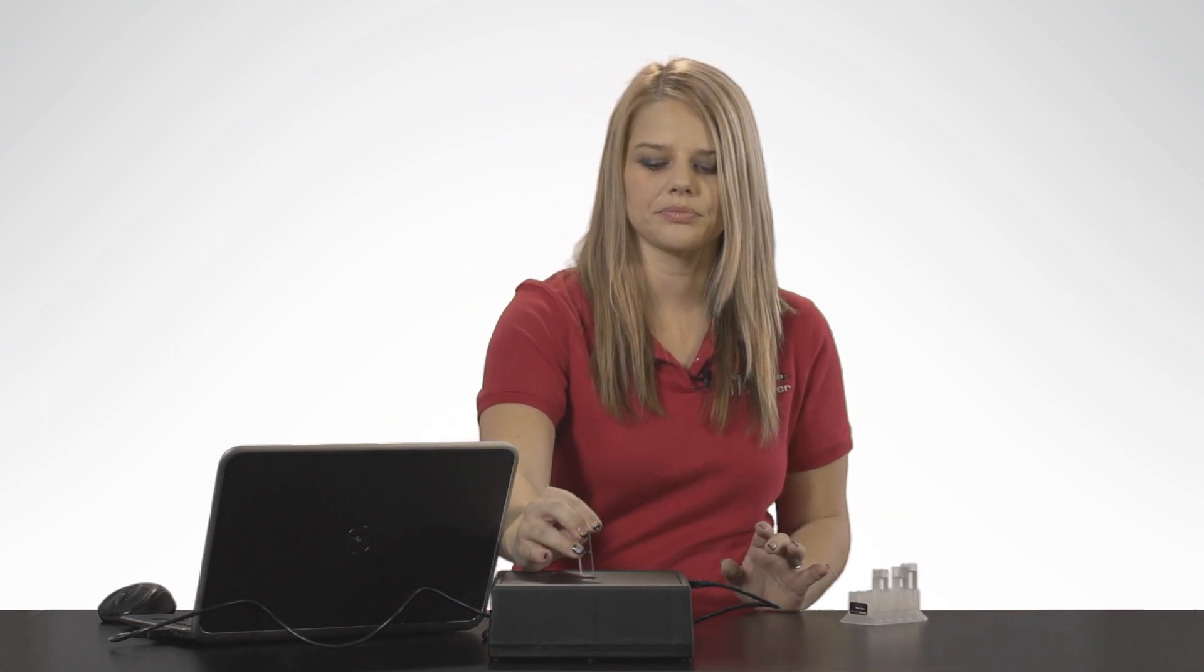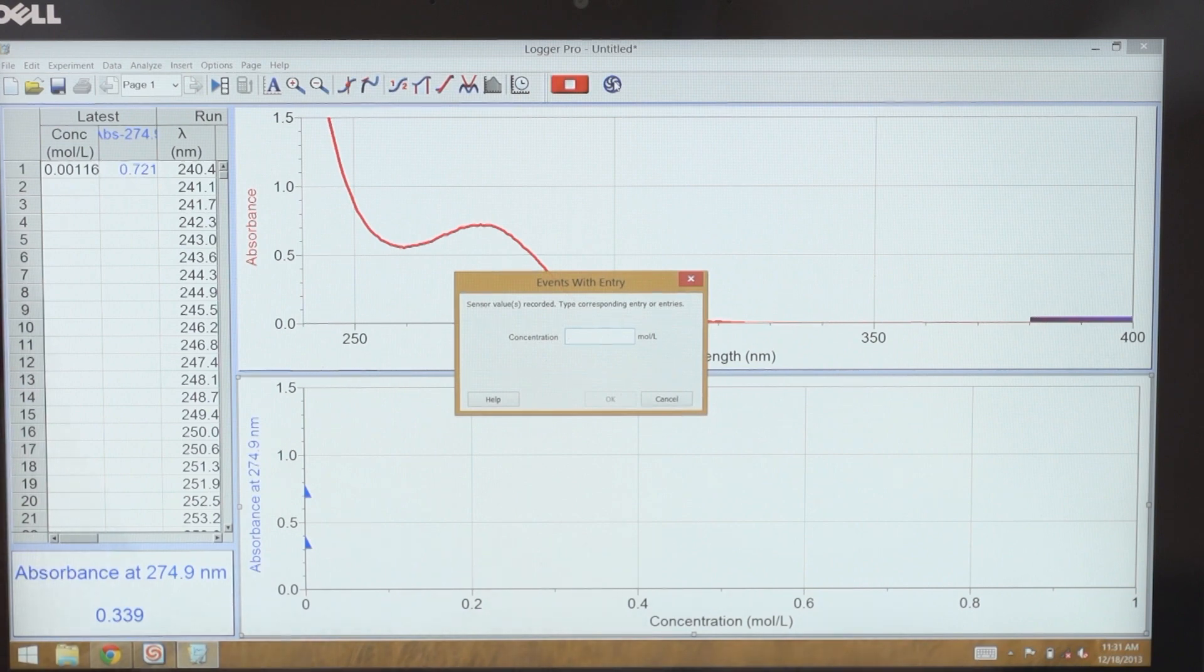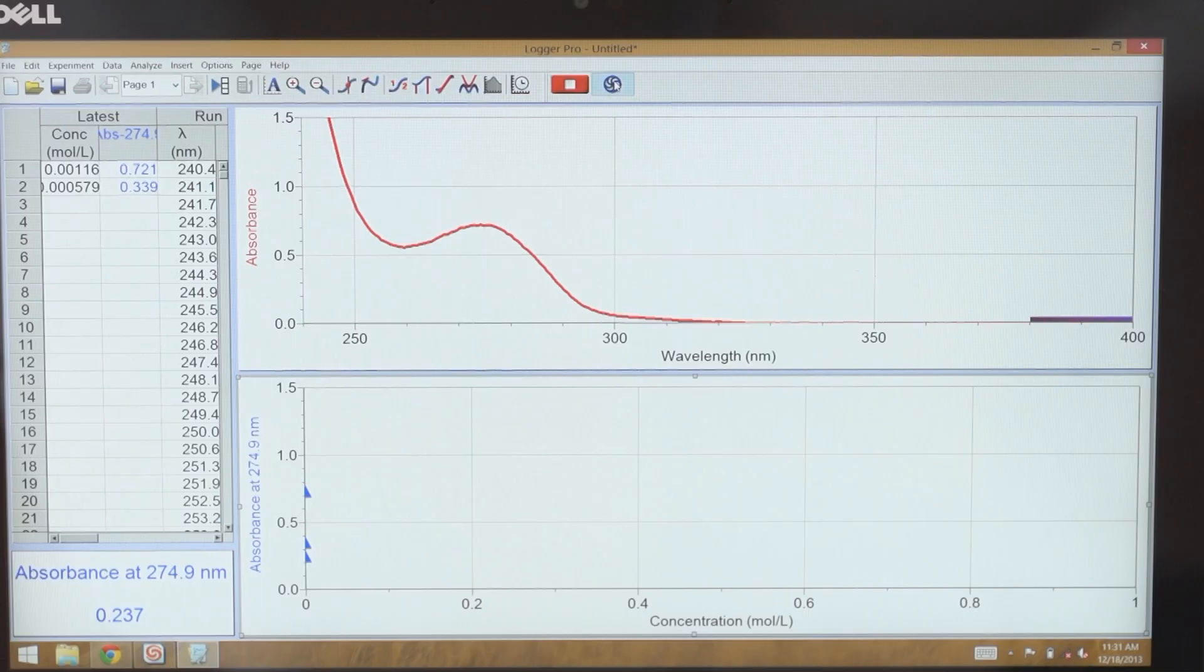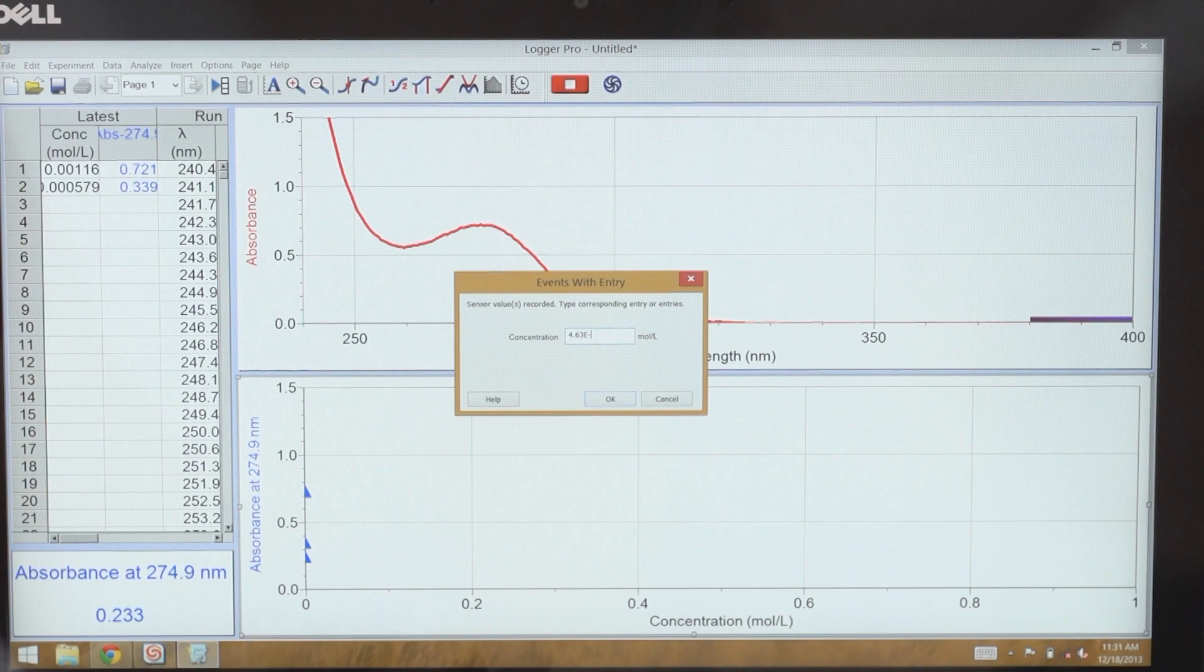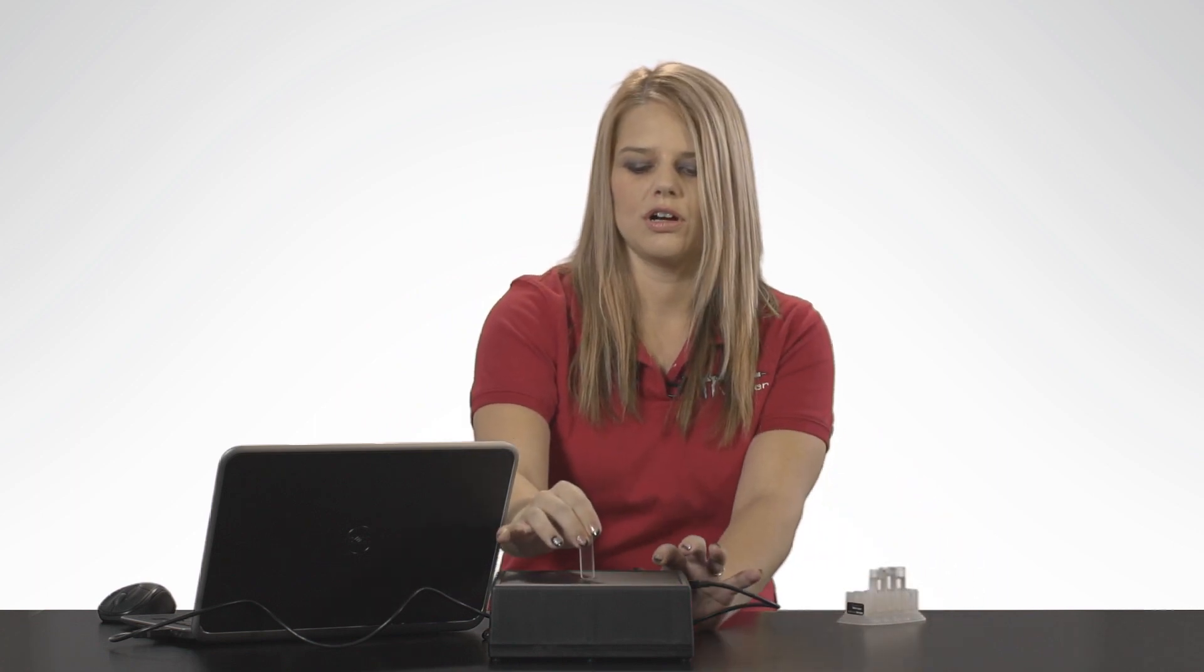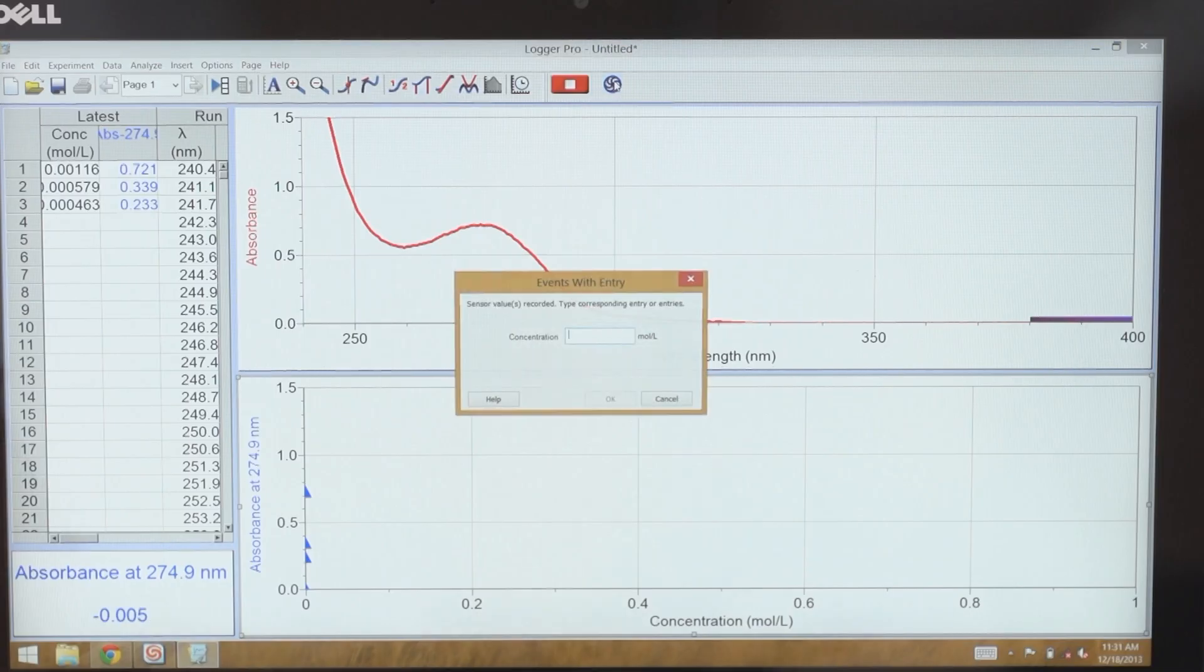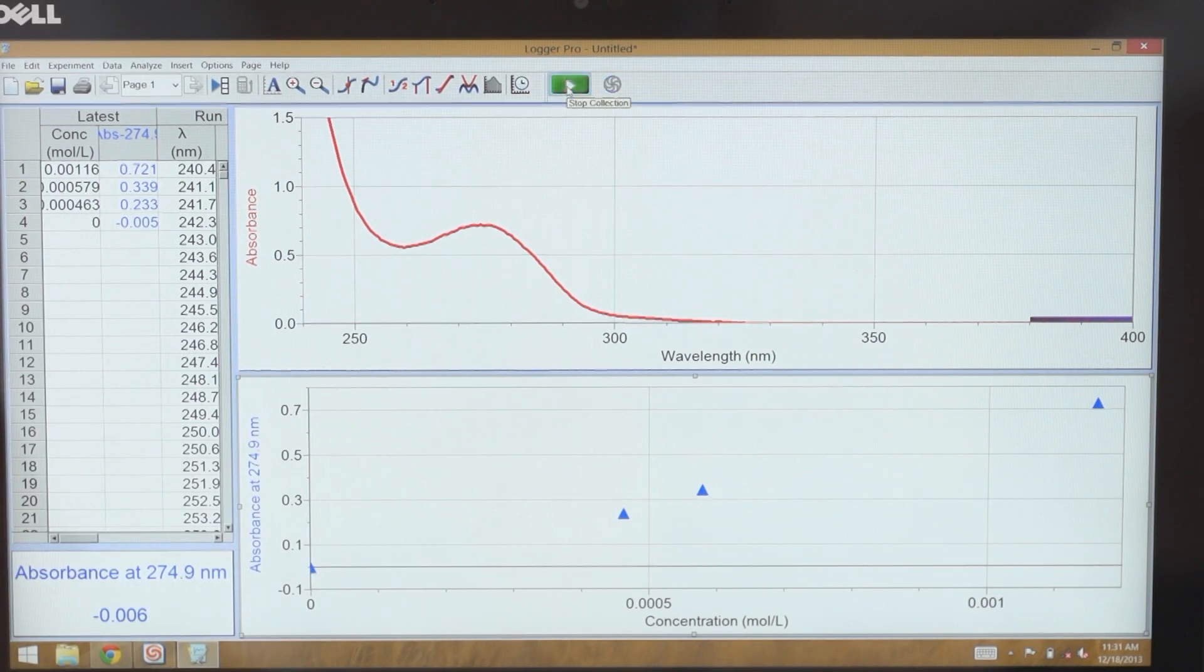Now I'm going to switch samples, wait for the absorbance value to stabilize, and then select Keep again. Put in my third sample, select Keep once the value has stabilized, and type in the concentration. I also want to make sure I get my blank value recorded. And then once I'm done with all my samples, I press Stop collection.